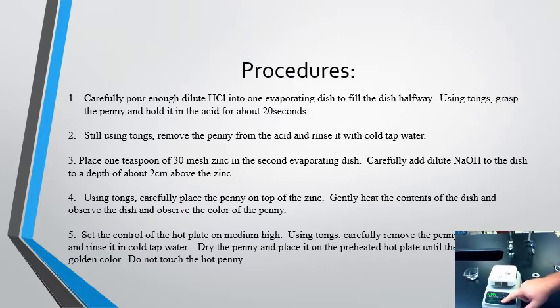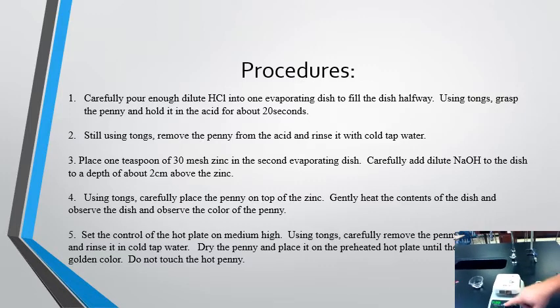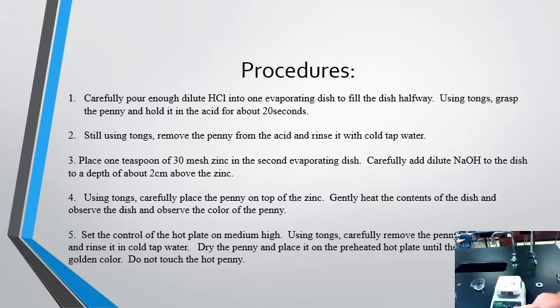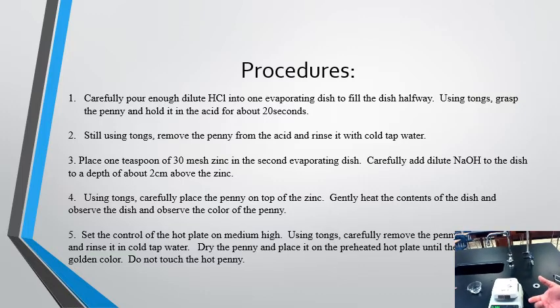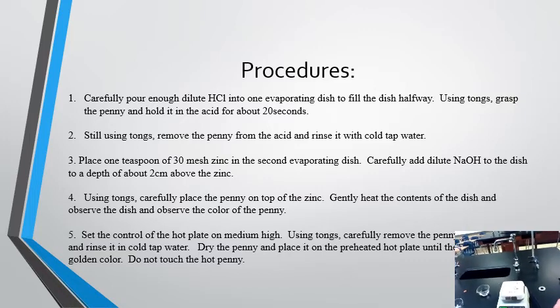We also have a stirring mechanism here as well if we're trying to run some reactions where we need to dissolve a solid into the liquid. We would use this as a quick way to make those solutions. So we don't need to worry about the stirring mechanism tomorrow, just the heat. For our lab tomorrow, we need kind of a medium-high heat, so we're going to turn it between 4 and 5. The dial goes between 1 and 10. So you want to have it somewhere between 4 and 5.